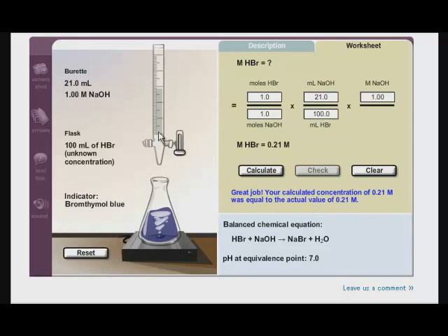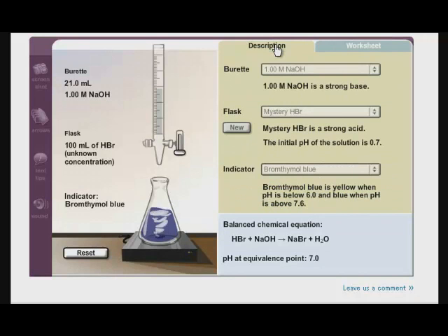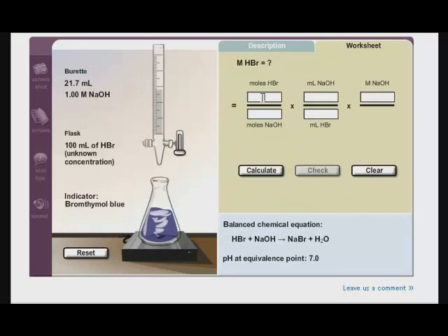So if I had ended up adding too much sodium hydroxide, let's just add a few more drops. And I get a concentration of 0.22 moles per liter. Well, it tells me that I used an incorrect amount of titrant. So I do get some feedback.